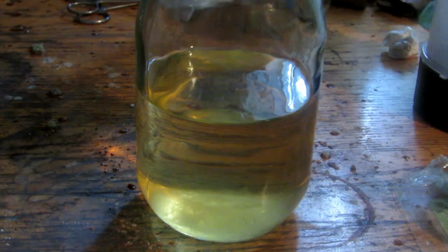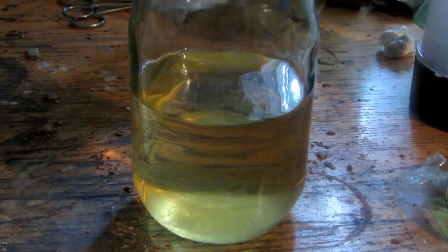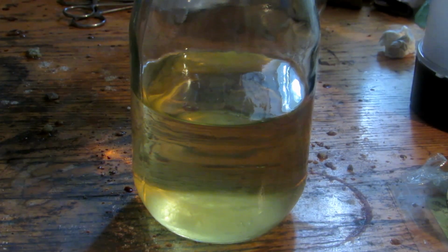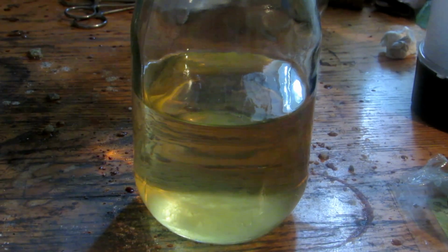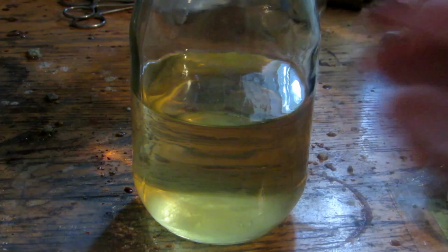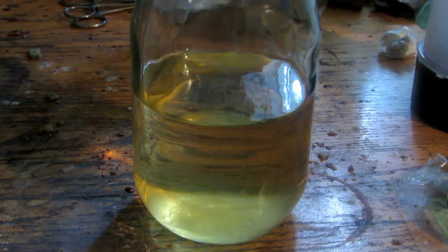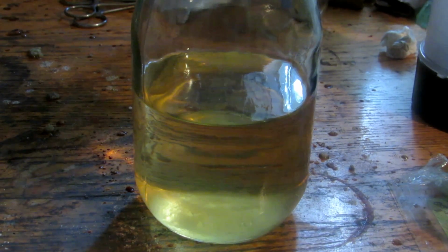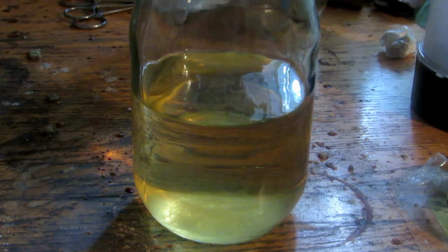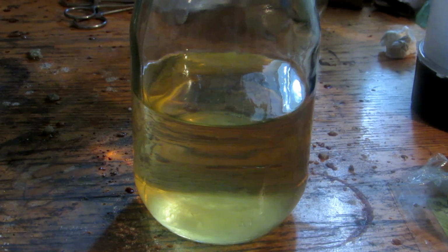And this can be done simply by adding a strong mineral acid, something like hydroiodic, hydrobromic, hydrochloric, sulfuric. Any of those acids will most likely work. And there's probably some others. So I'm not actually sure of the concentration of sodium silicate that we have in solution currently, because I wasn't sure how much we made. Now you could boil this down to figure out exactly how much hydrochloric acid or sulfuric acid or whatever you would need. However, that is an additional step, and boiling this down could be a pain in the butt.